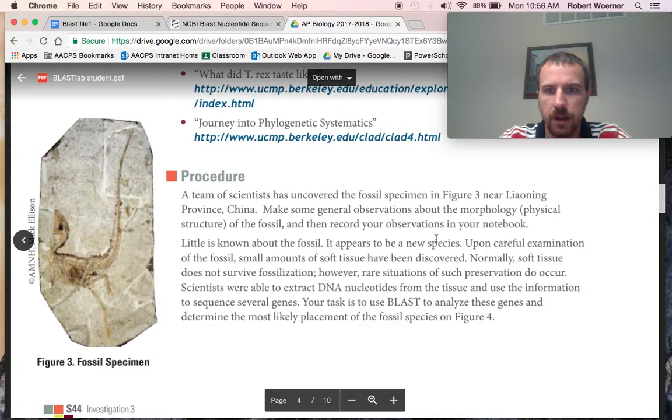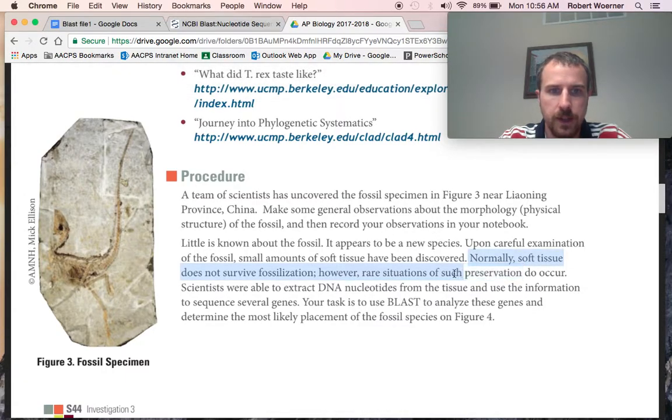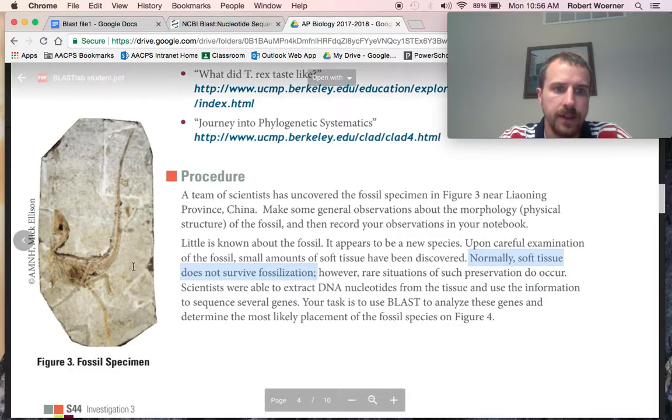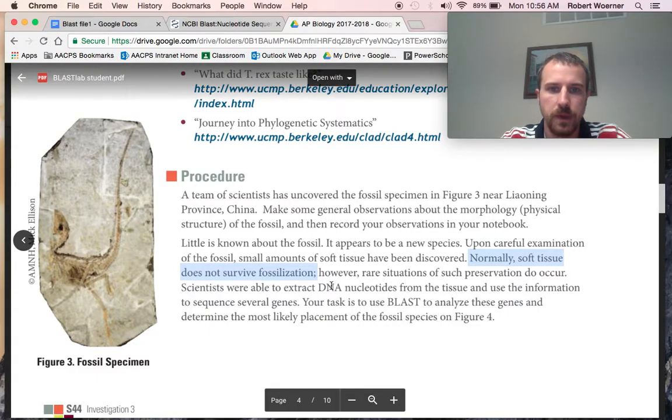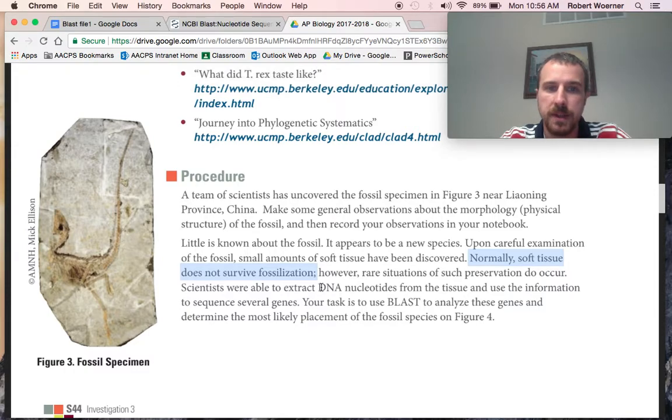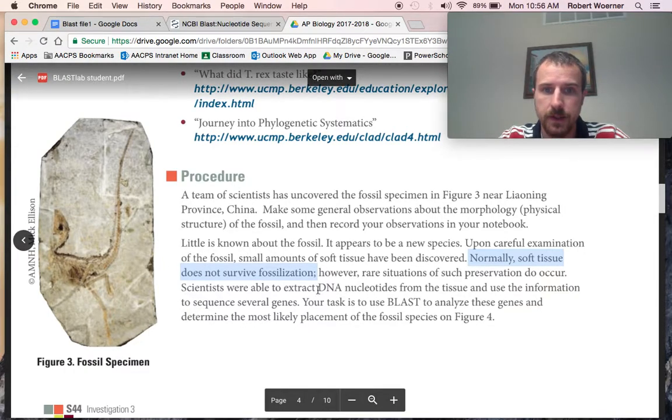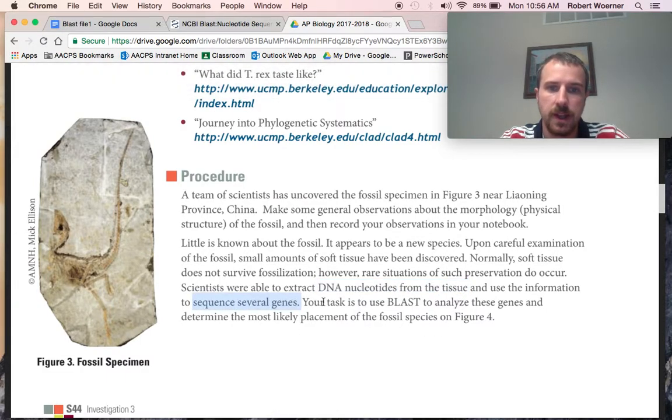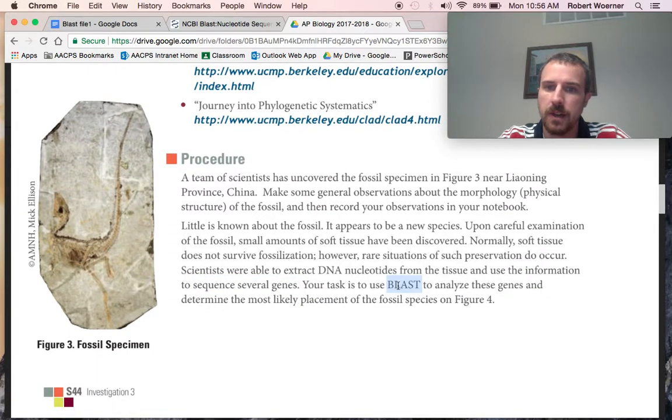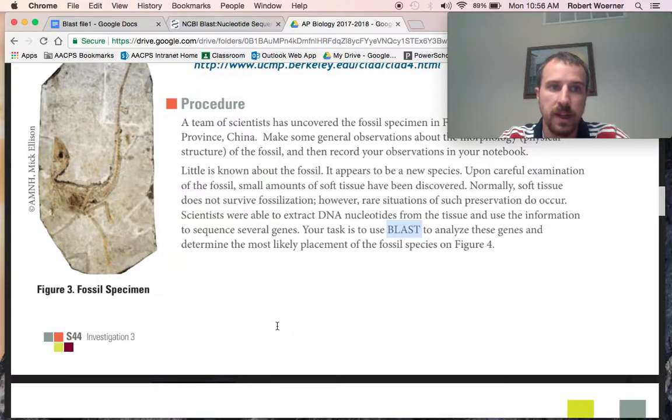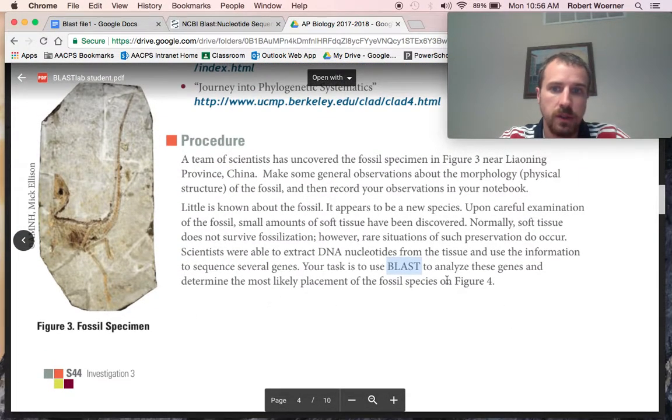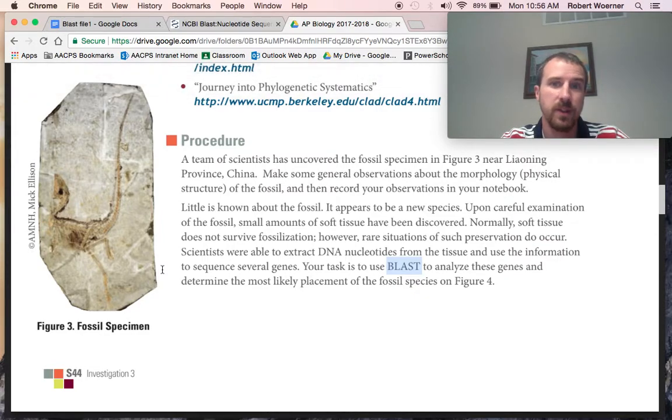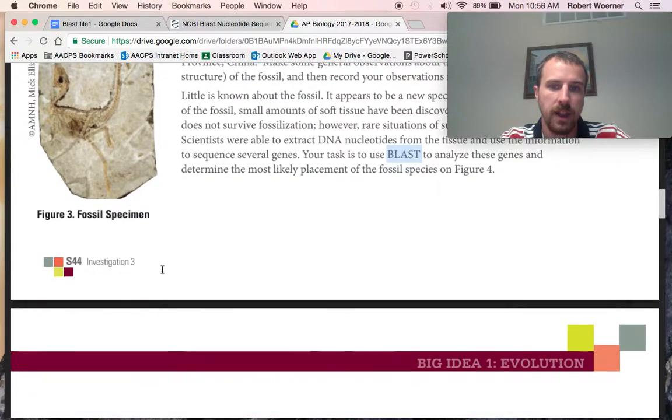What it says in this paragraph is that, normally we don't find soft tissue with fossilization. It decays. We have to look somewhere else for DNA. However, sometimes we can find DNA in the bones. So, we were able to extract some DNA from tissue and use that information to sequence genes. We're going to use BLAST to analyze these genes and make a determination where we would put this fossil. So, we have some DNA. We don't have the entire genome of this creature, but we have some. And that can help us to determine where it goes in its evolutionary phylogeny.